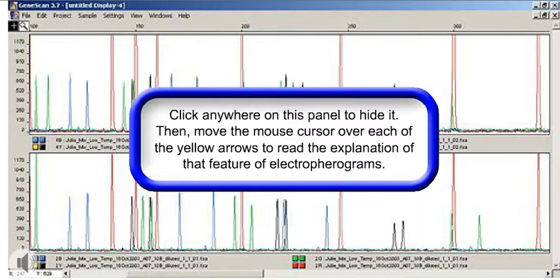Click anywhere on this panel to hide it. Then move the mouse cursor over each of the yellow arrows to read the explanation of that feature of electropherograms.